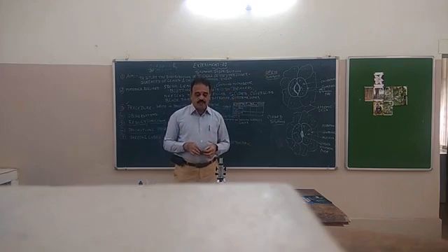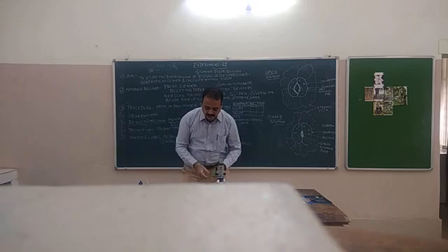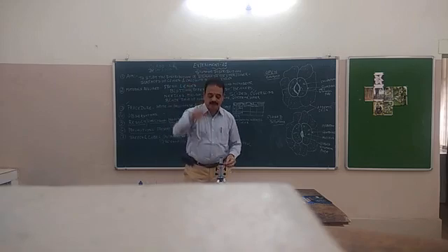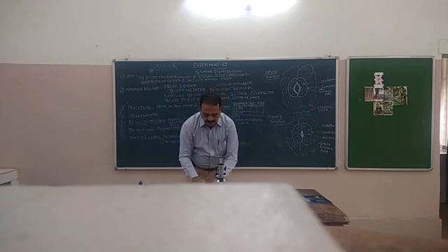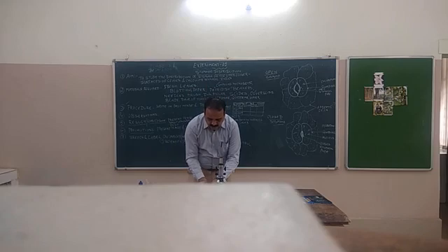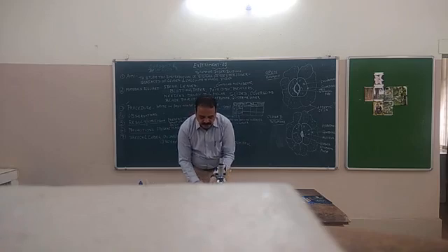After having taken this, what do you require? You need to just tear this like this. When you tear this, you can see a thin plastic-type layer here. So that layer, you keep it on the slide. This is the slide. On the surface of the slide, you keep it. With the help of a blade, cut that transparent membrane in this way. Cut that. And then with the help of a needle, don't damage the tissue, slightly you separate it.